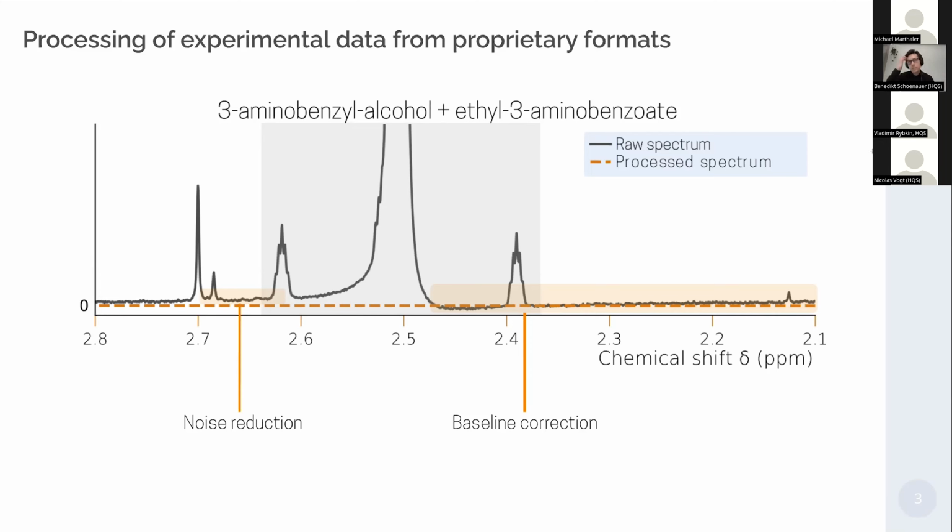And the other thing that you see here on the right is this baseline problem that Nico has pointed out. We have values below 0 and above 0, and even a slope to the spectrum, and all of this shouldn't be here. We should have 0 spectral weight in areas where there is not a resonance. So here you see that even in practice, even for this rather good spectral data that we got, we have to do all this cleanup first.